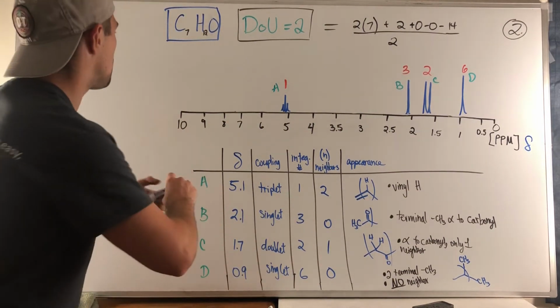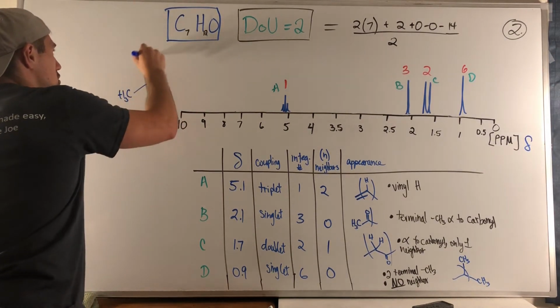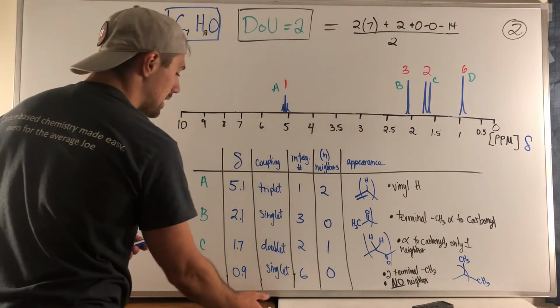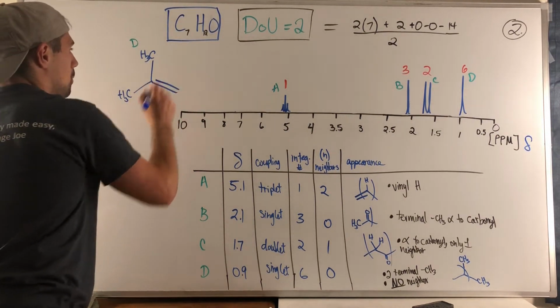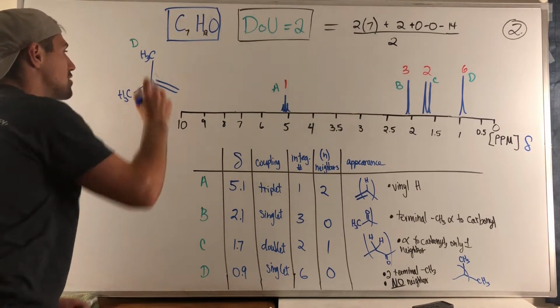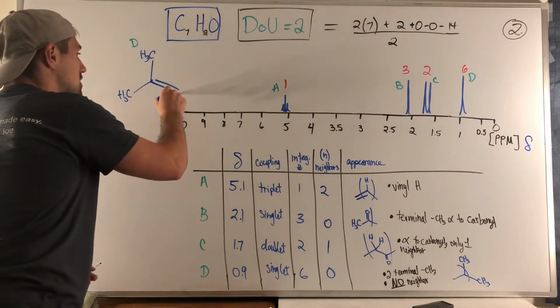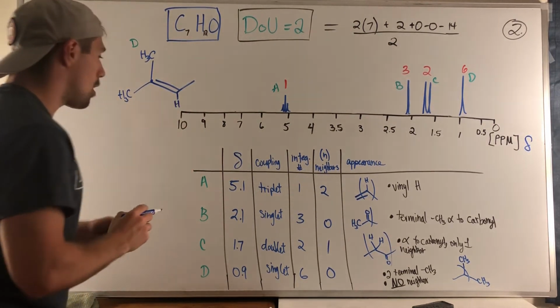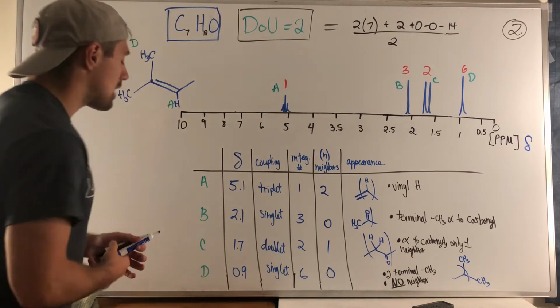One thing I think is very easy to figure out is, if we wanted to start with one end of our structure and we have our CH3s right here, this is peak D, how can we make it so that these 6 hydrogens have no neighbor? Well, let's put a double bond right there. That means this carbon by default has no hydrogens, has no peak represented in our spectrum, and that sets us to chug along because there's only 1 hydrogen here if I keep my chain going. So if I think this is peak A, how can I then continue that?